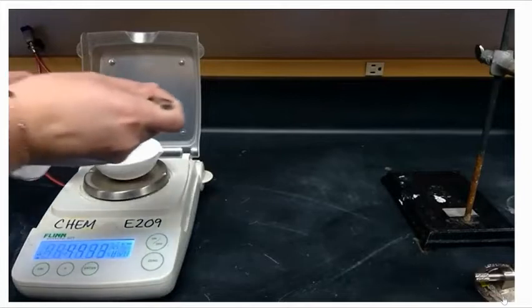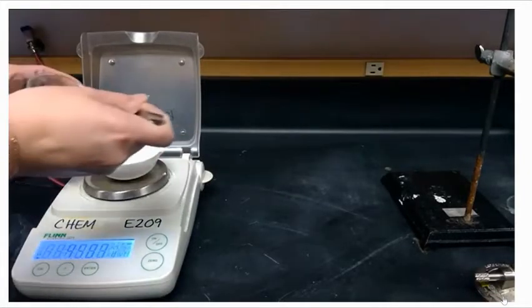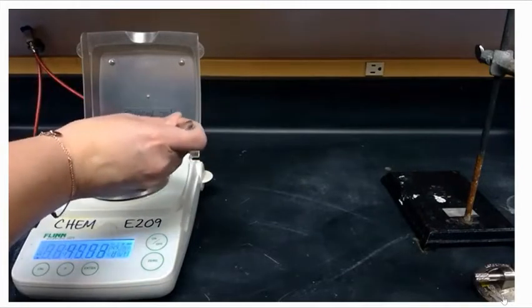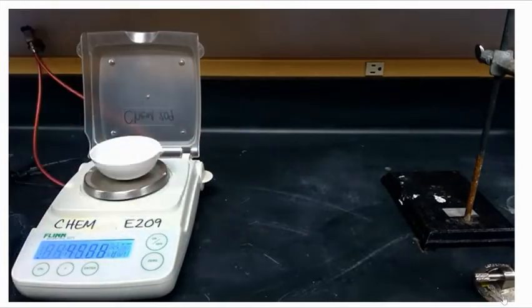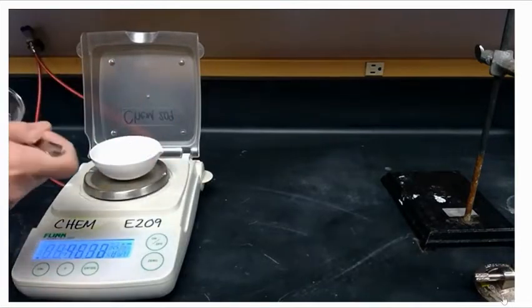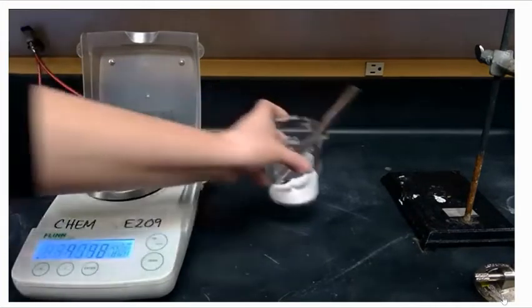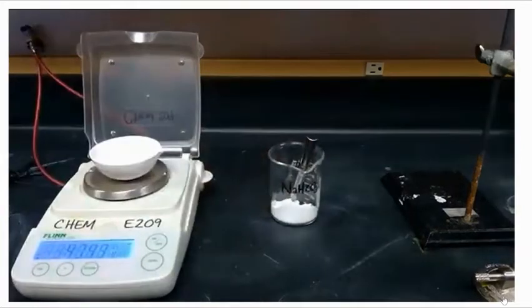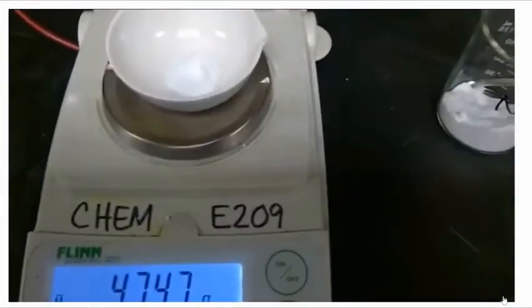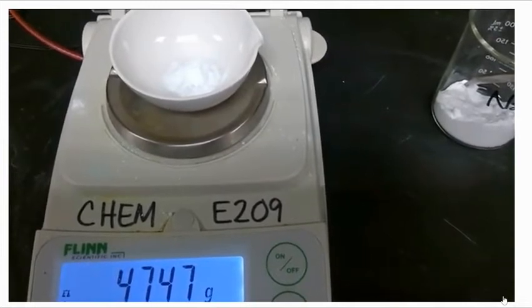And according to the lab sheet, we wanted approximately 2 to 3 grams of baking soda. Please record the mass of the baking soda and evaporating dish, 47.47 grams.